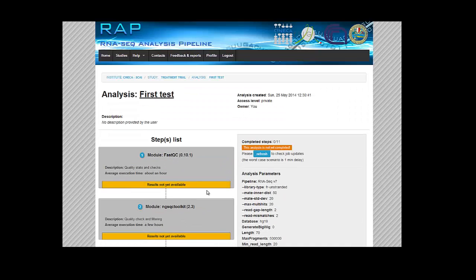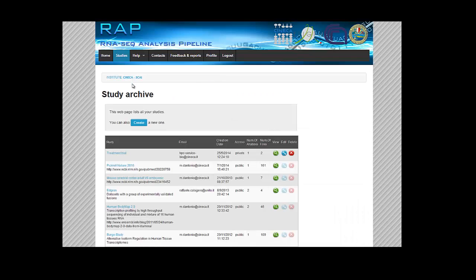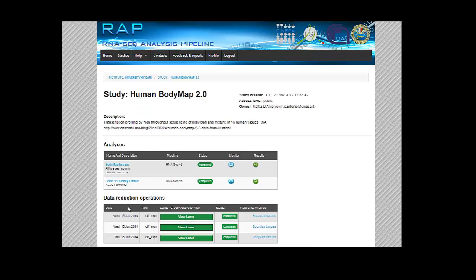So let's check out a completed analysis in our public studies so we can see what it actually looks like. Let's check this Body Map Tissues.